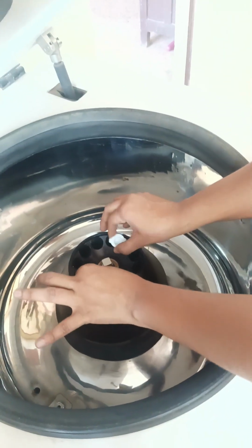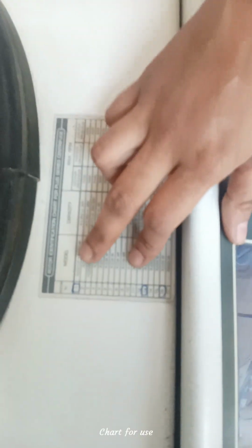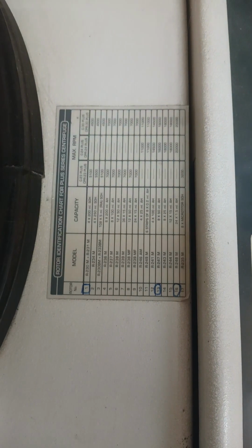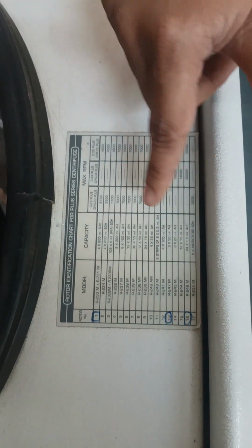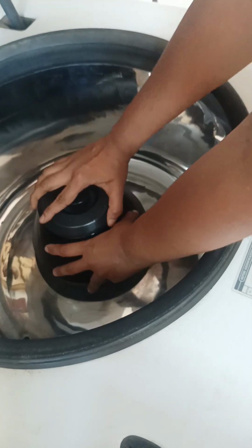For the time being I am removing the tubes and showing you now how to set it. Here the model, capacity and maximum RPM are given. This is rotor number 15 with the capacity of 12 tubes of 15 ml, and how much RPM you can set is also given, 18,000. Accordingly you have to refer to this chart, and after referring to it you are supposed to operate the machine. Now I will close the lid and try to show you the setup.